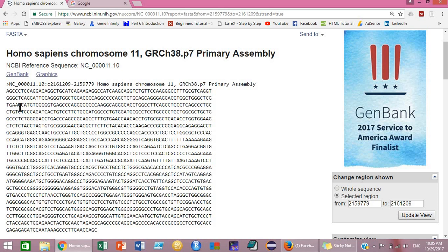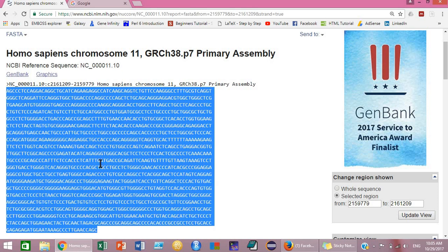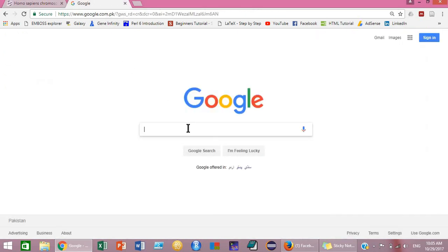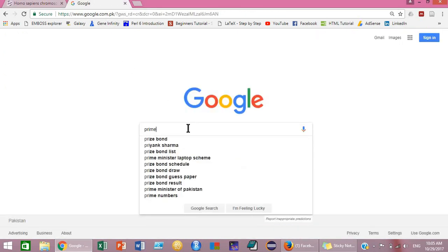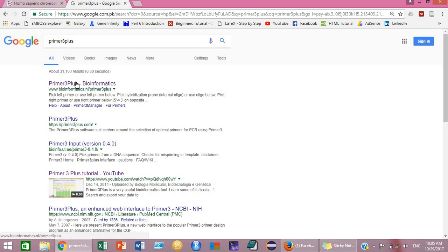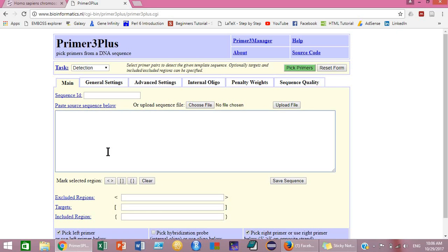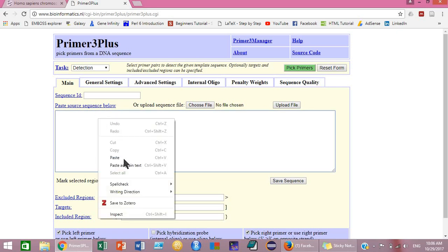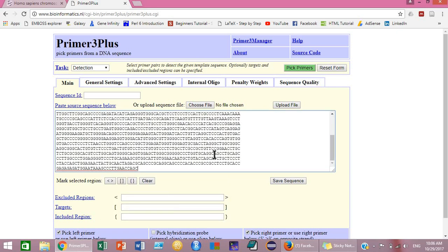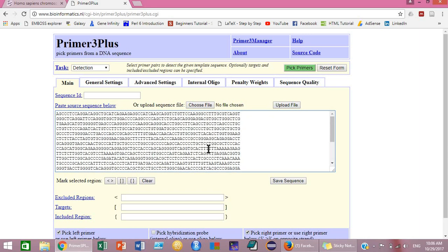Select the Homo sapiens insulin gene sequence, copy it, then go to Google and search for Primer3Plus. Click on the Primer3Plus link and paste your sequence in the sequence input region. Then you will have to identify the target region for which you are going to design your primers.